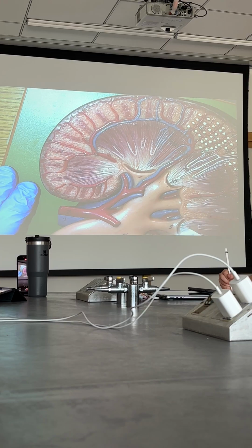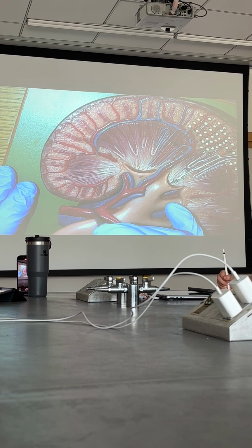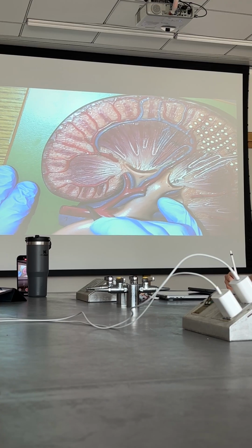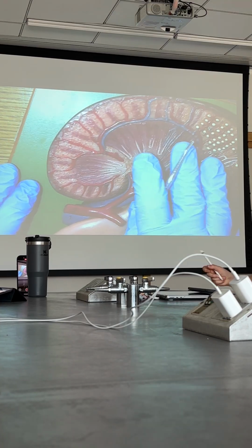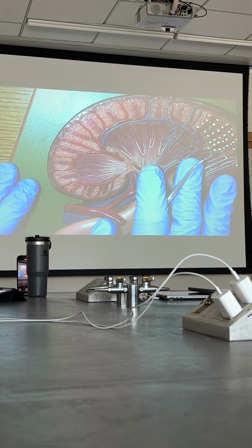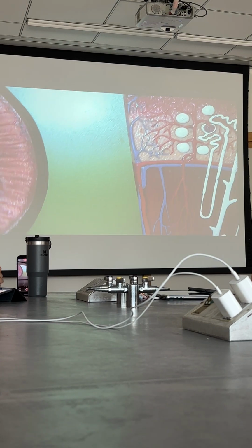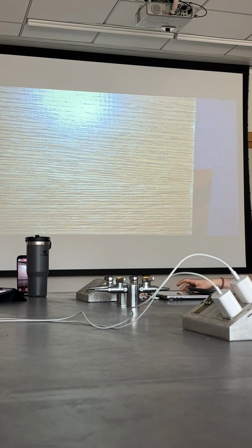Now, sometimes the interlobar vein will directly dump into the renal vein, so you may or may not see a segmental vein, but don't worry, I'm not going to give any questions that will trip you up with that. I just want you to be aware of that. All right. Next, let me do the fetal pig, and then I'll finish up with the microscope slides.